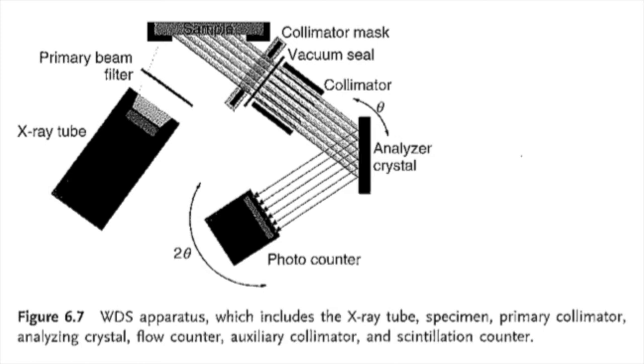And so that is kind of a reverse of a diffractometer that uses a known wavelength to get the d-spacing. So we're kind of doing it in reverse there.